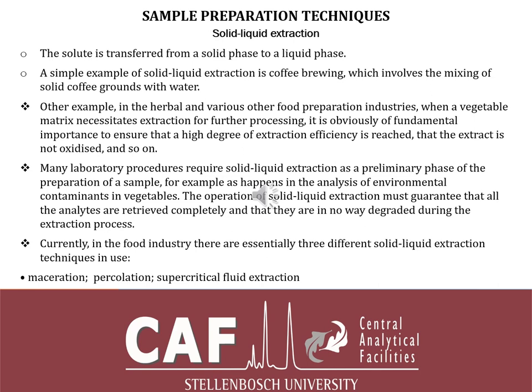Many lab processes require solid liquid extraction as a primary phase for the preparation of a sample. For example, in the analysis of environmental contaminants in vegetables, the operation of solid liquid extraction must guarantee that all the analytes are retrieved completely and that they are in no way degraded during the extraction process.